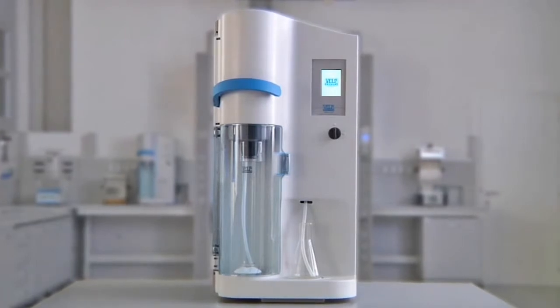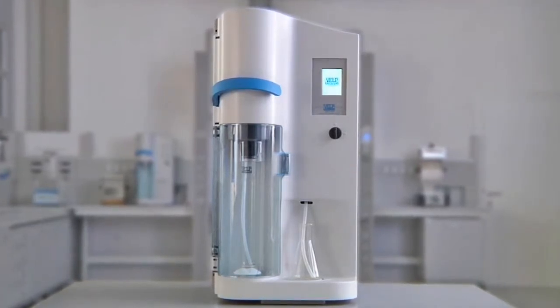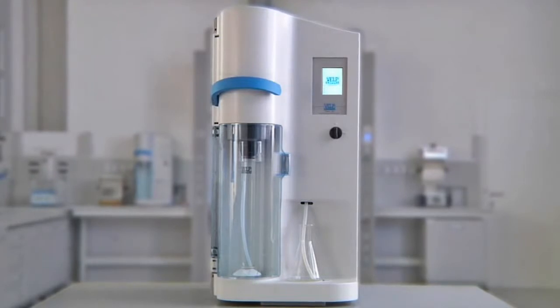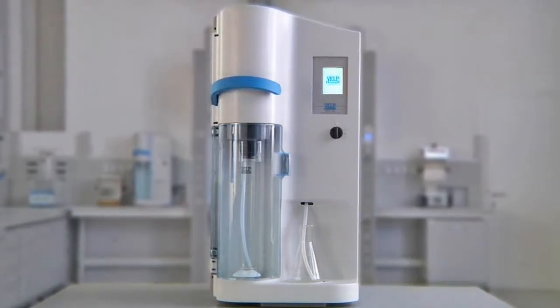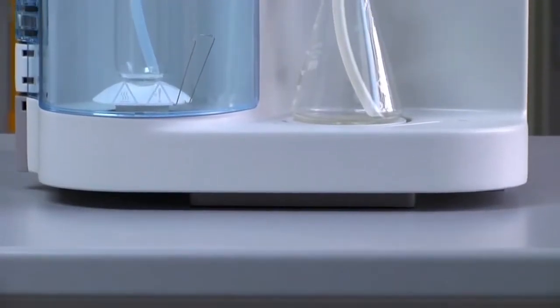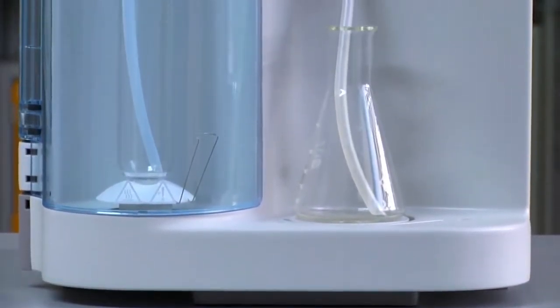UDK 149 Automatic Distillation Unit. These modern Kjeldahl systems from VELP Scientifica cover every stage in the process for the determination of nitrogen, protein and other components, from digestion to distillation and finally titration.